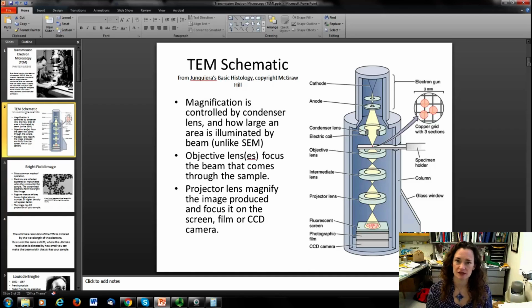There's other kinds of filaments, and for a more in-depth discussion of the optics of TEMs, SEMs, and other advanced microscopies, I really suggest you take our electron microscopy course. But once the electrons are created via thermionic emission in a tungsten filament TEM, they're accelerated from the cathode to the anode by a high voltage. Now, in a scanning electron microscope, this voltage is on the order of, say, up to 30,000 volts in a typical SEM. In a typical TEM, the voltage is a factor of 10 higher, okay? So typical TEMs have voltage ranges that go from, say, 100,000 volts to 300,000 volts, all right?